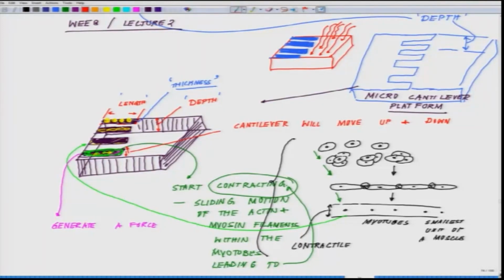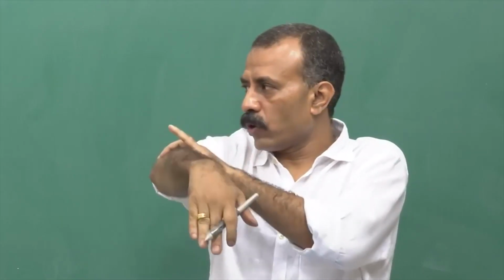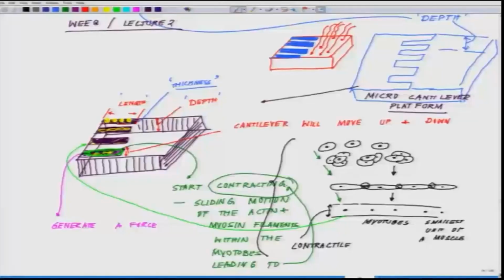I do not see a side motion happening there because it is already held in place. So, it will be moving up and down, and will oscillate proportionally to the force generated by the myotubes.